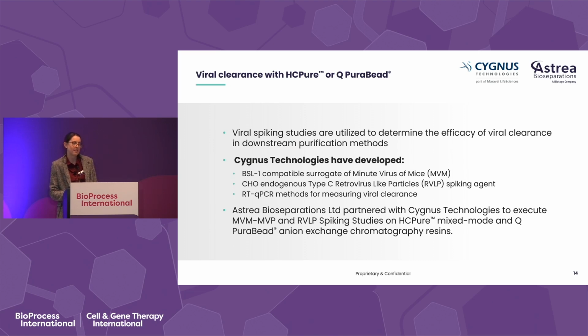It's not to replace the need to do the CRO viral clearance studies, because they're a regulatory requirement, but it gives you a prediction of what to expect, and also it means that when you're developing your method, you have the viral clearance study in mind from the beginning, rather than it being a tick box exercise once you need that regulatory approval.